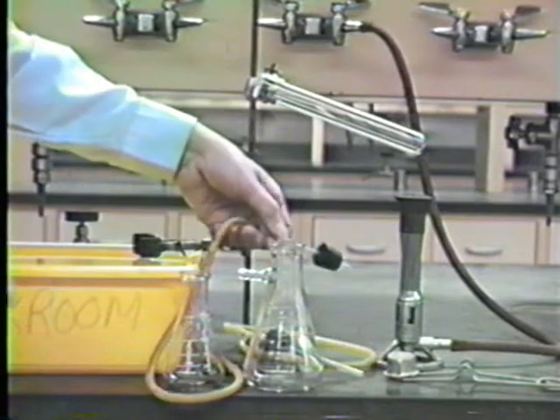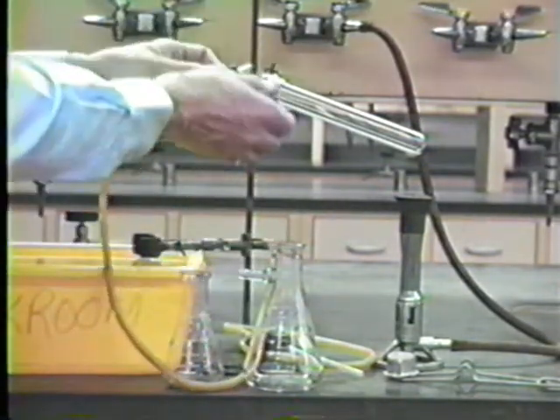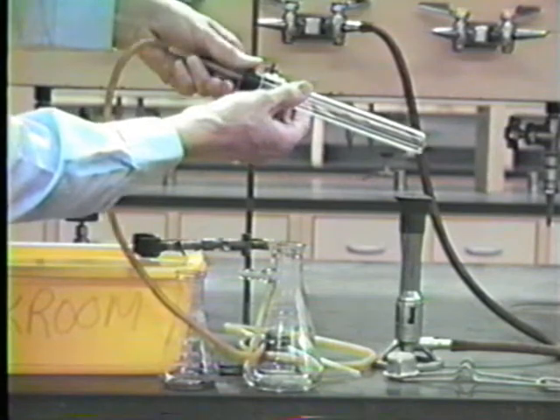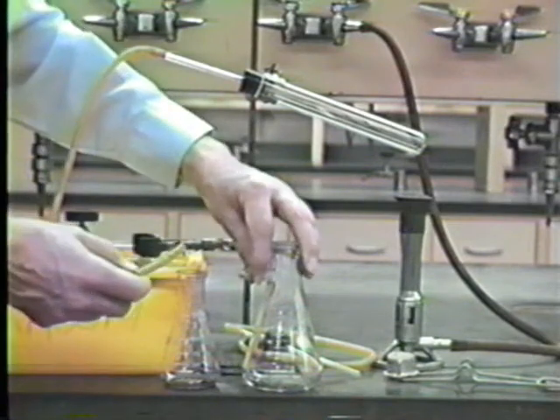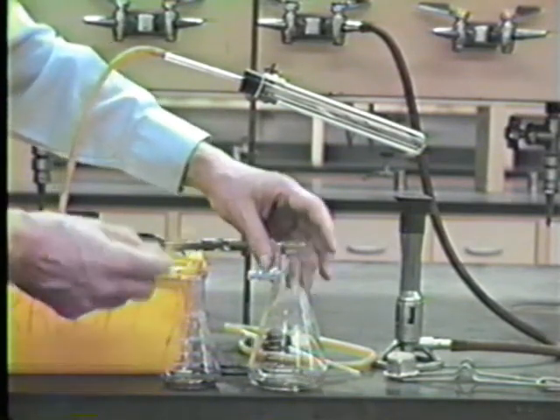Then you will get this tubing. You will set up the tubing in this manner. This part gets clamped in place over here, the top of the test tube. The other end goes to the side arm of your reservoir. This is a suction flask which uses a reservoir here.